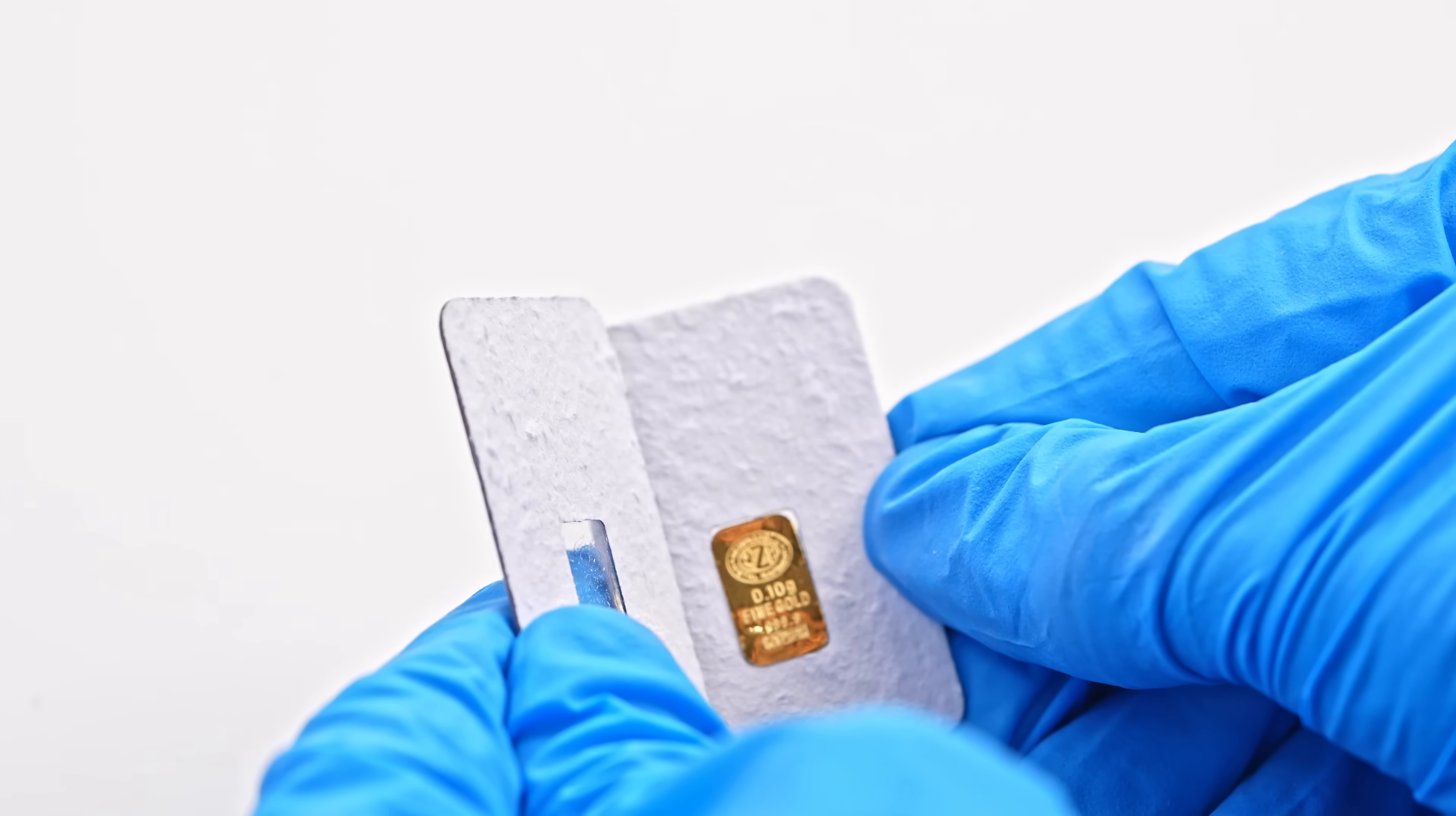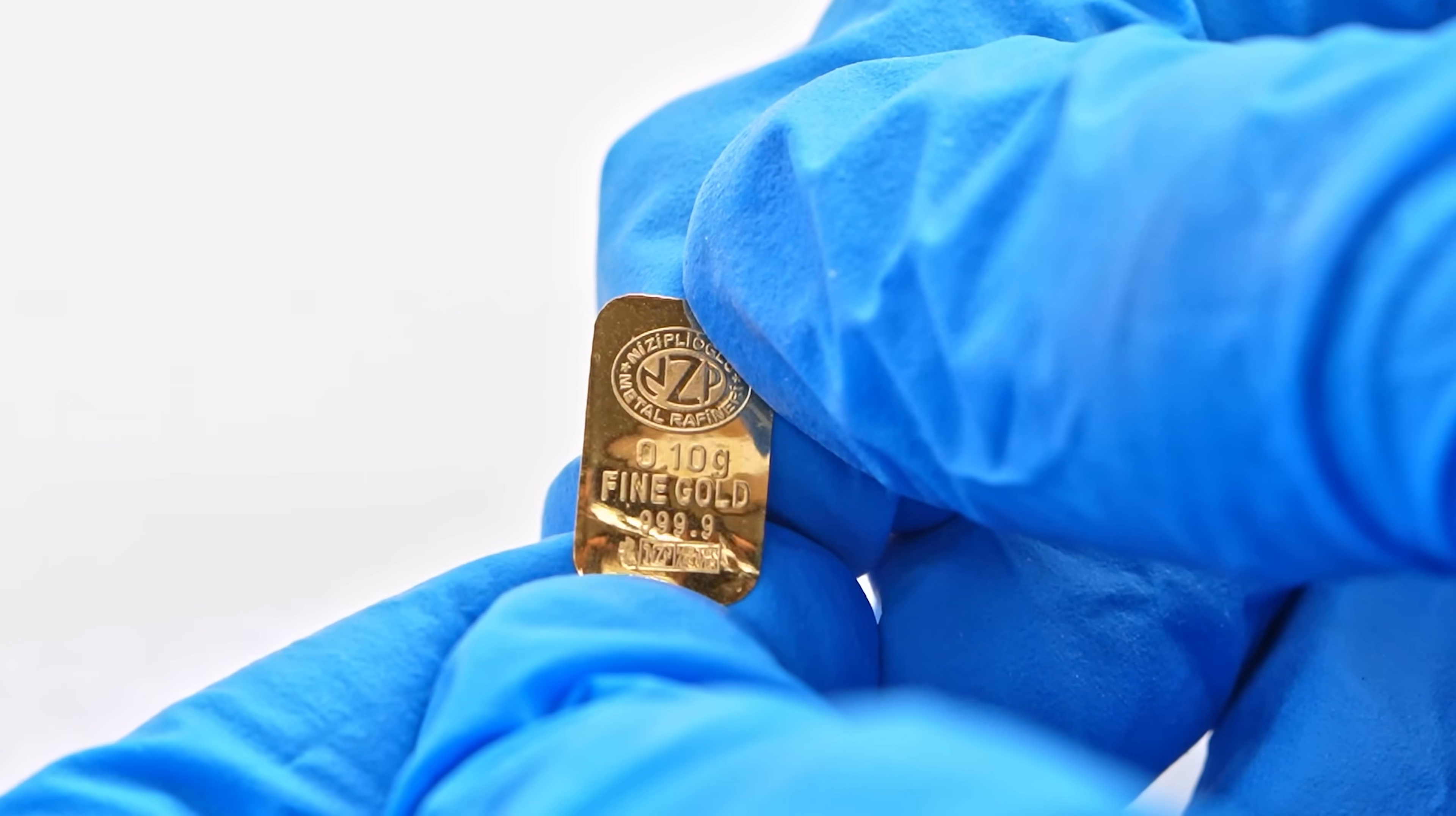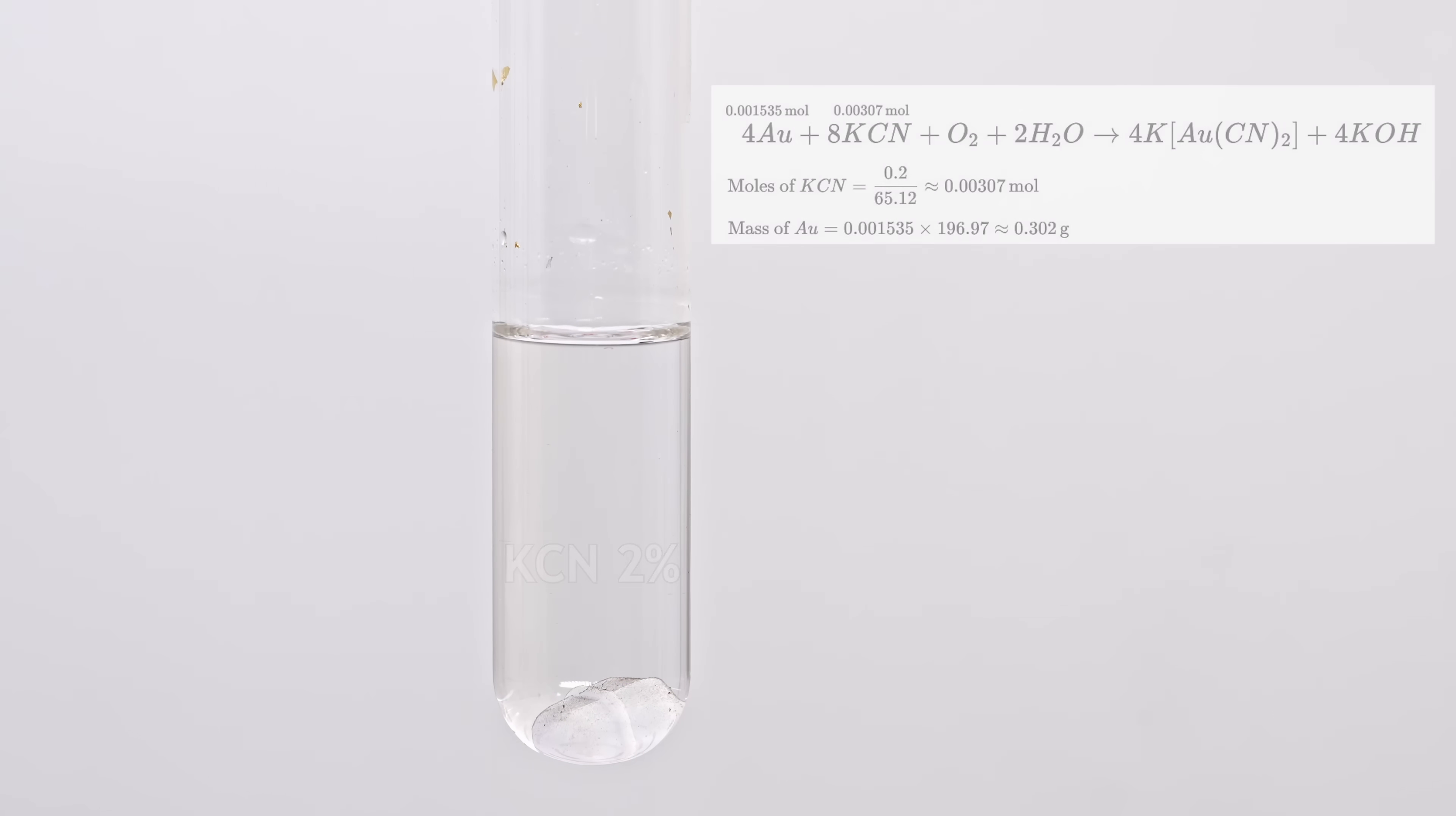Now let's try to dissolve not foil in potassium cyanide, but this gold ingot. This sample of gold is 100 times thicker than foil, and 7 times heavier. This is 100 milligrams of pure gold. And now I'll place this ingot in 10 milliliters of a 2% solution of potassium cyanide, through which I'll pass pure oxygen. Based on the reaction equation, this amount of gold should dissolve in this amount of solution.